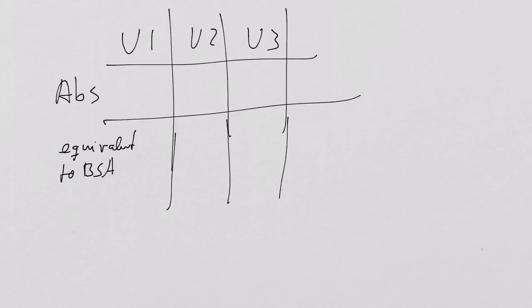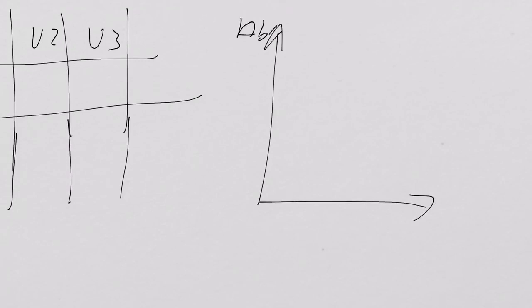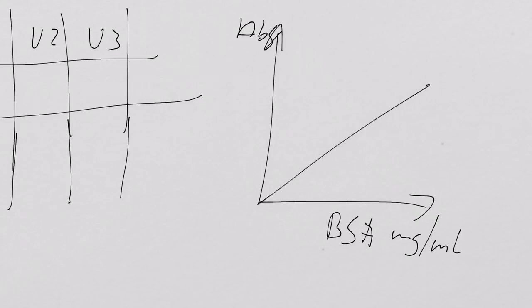What I mean by that is, when you look at your graph, absorbance against BSA, milligram per milliliter, this actually means this one here.